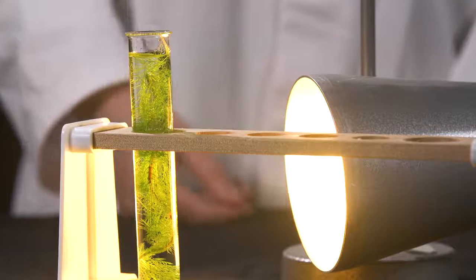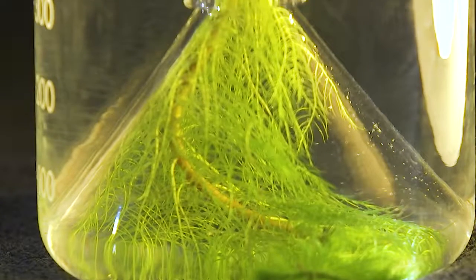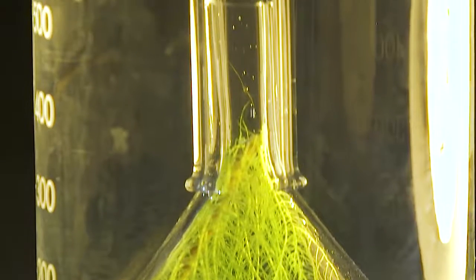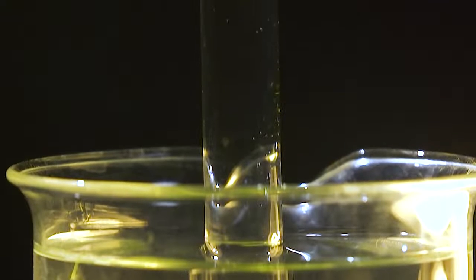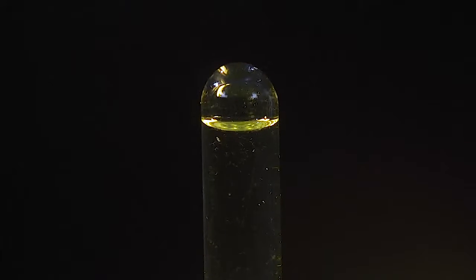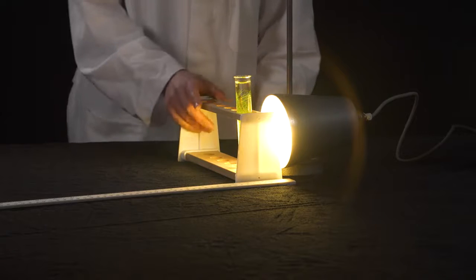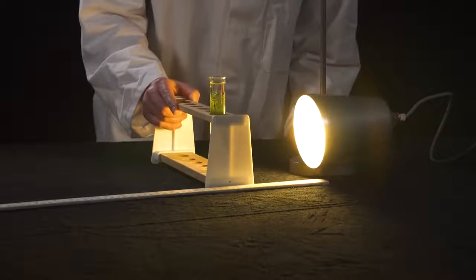As shown earlier, pondweed can also be placed in a beaker under an upturned funnel with a test tube over the top, so that the bubbles produced move up the neck of the funnel and displace the liquid in the test tube. You need to use a glass funnel for this setup because students will not be able to see the bubbles through a plastic funnel. These setups can then be placed at varying distances from a light source to investigate the effect of light intensity on the rate of photosynthesis.